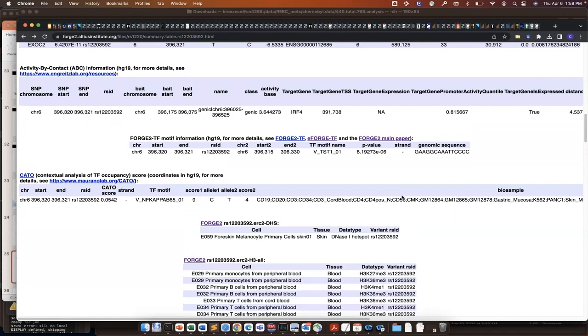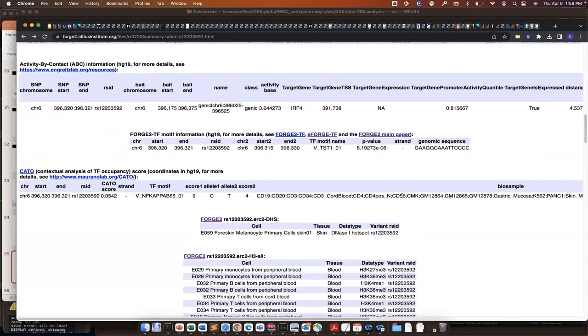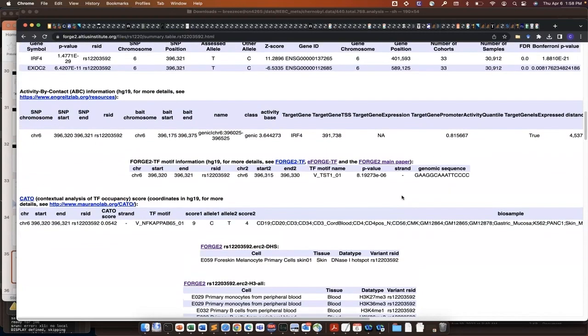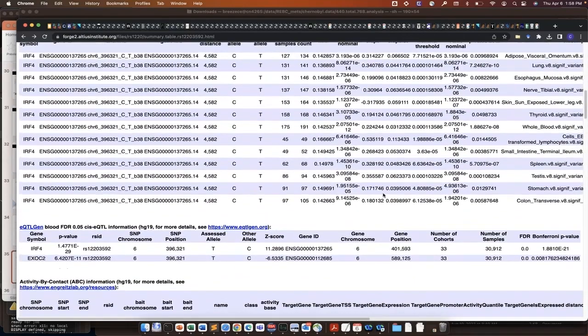However, I think the question is also about bivalent regions. Some regions have both H3K27 trimethylation and H3K4 trimethylation, and those are bivalent promoters, a special type of promoter. For those, it's very important to look at these overlaps. So I think that question is especially useful if you're interested in bivalent promoter regulation. But almost every enhancer in one cell line is somehow repressed in another.